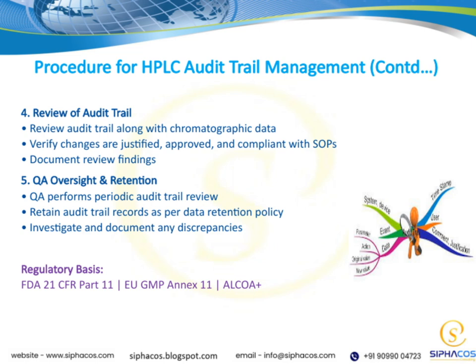All of these steps are grounded in regulatory requirements, such as FDA 21 CFR Part 11, EU GMP Annex 11, and the ALCOA Plus principles. These regulations emphasize the importance of data integrity, security, and accountability. Lastly, this process is part of our ongoing management of HPLC audit trails, ensuring that our data remains trustworthy and compliant throughout its life cycle.